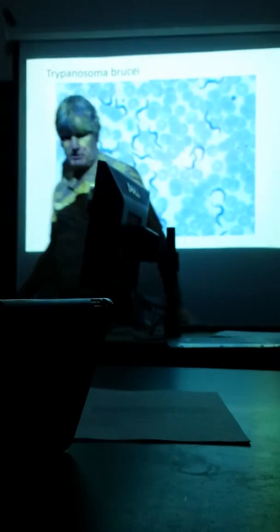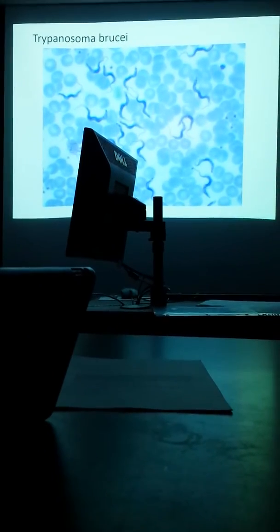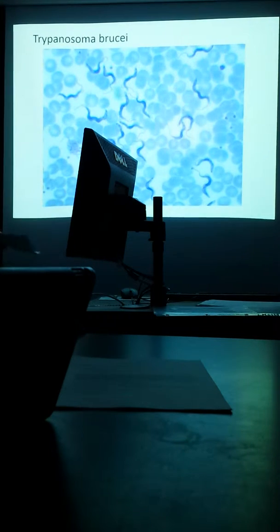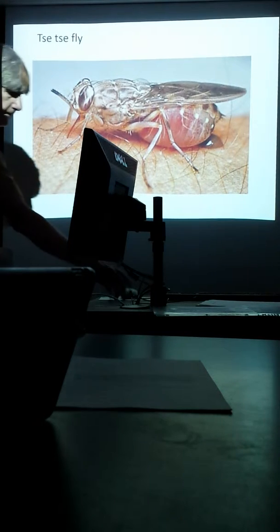Now the thing about the protozoans, we have here first of all the Trypanosoma. Two different samples have blood, so you can see the red cells right here, but these of course are between the cells, they're flagellated. The vector's a tsetse fly. Again, that picture out here somewhere. See, it's full of blood.